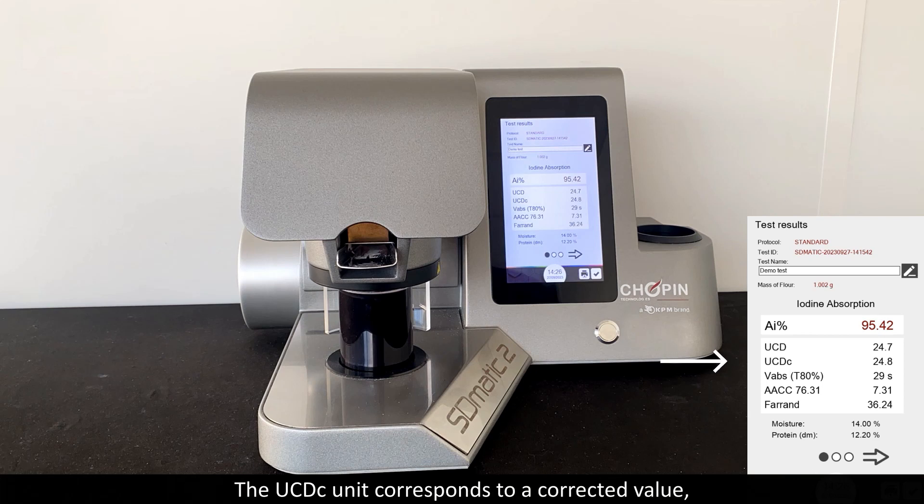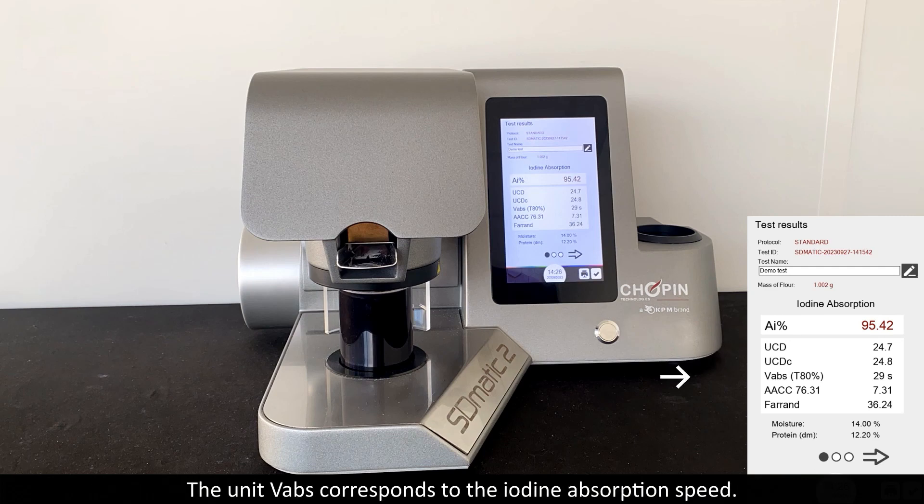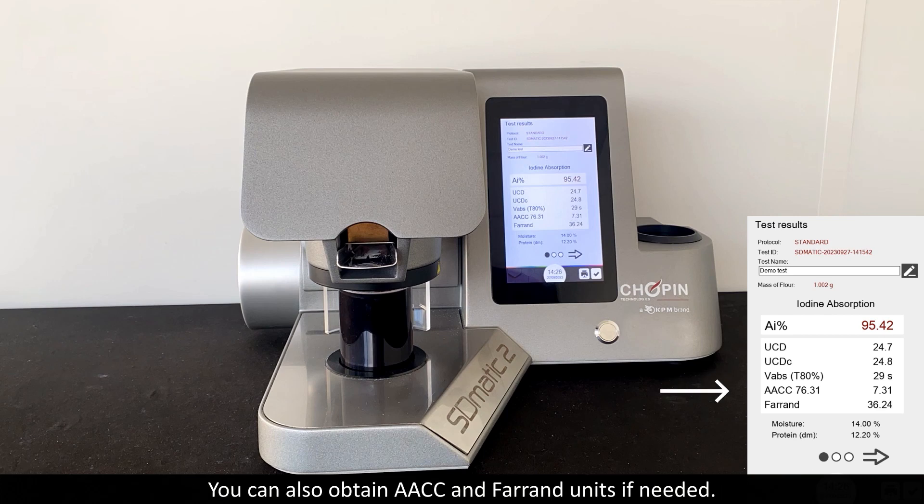The USDC unit corresponds to a corrected value taking into account the moisture and the protein content of the sample tested. The unit of ABS corresponds to the iodine absorption speed — this is the time required for the flour to absorb 80% of the iodine generated. You can also obtain AACC and Farrand units if needed.